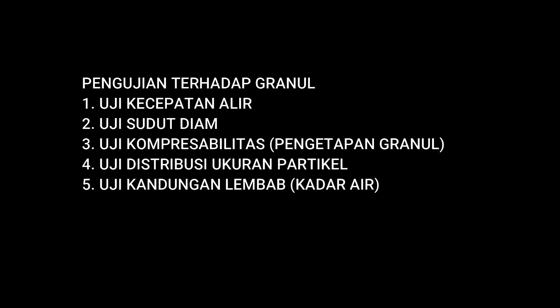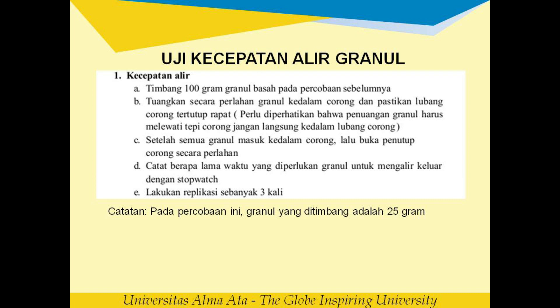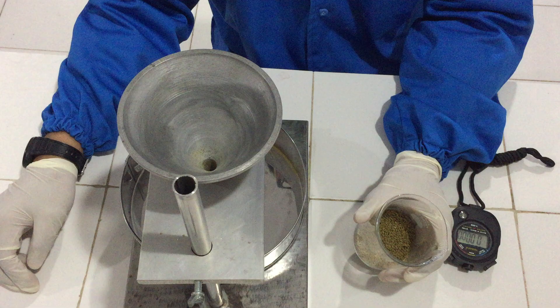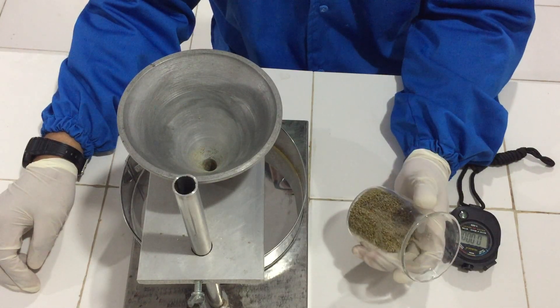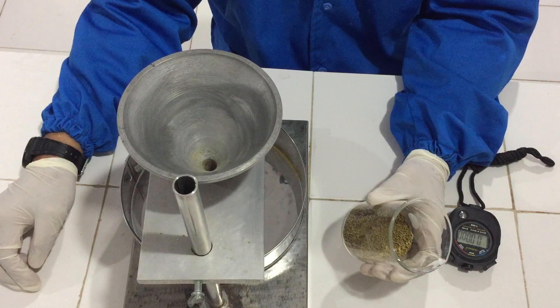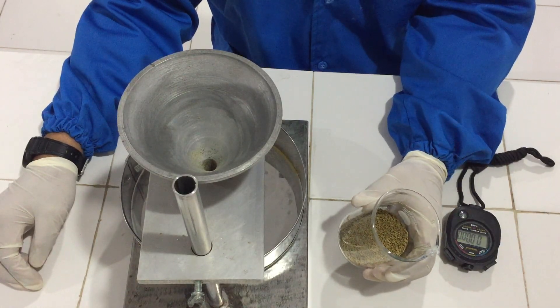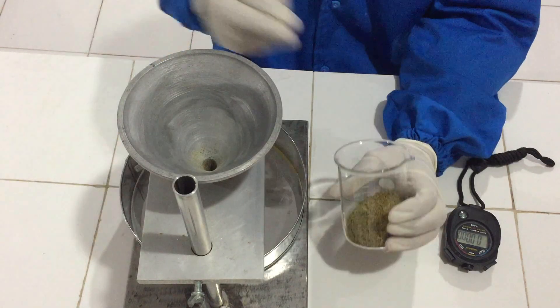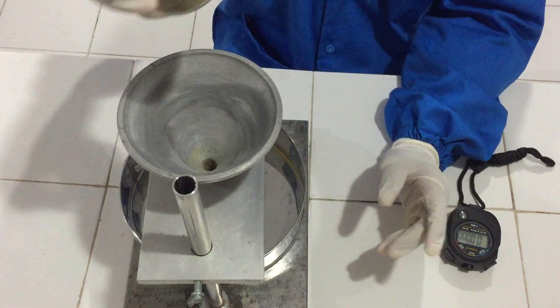We will be working with FTS Padat. Here we have granule extract ethanol. In this video, we will be able to test the flow rate (laju alir). Here we already have 25 grams of granules.